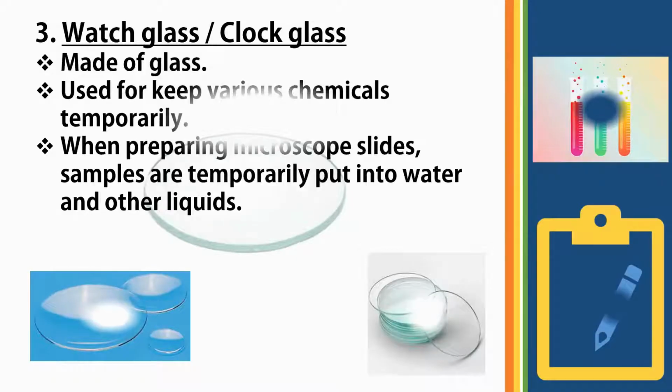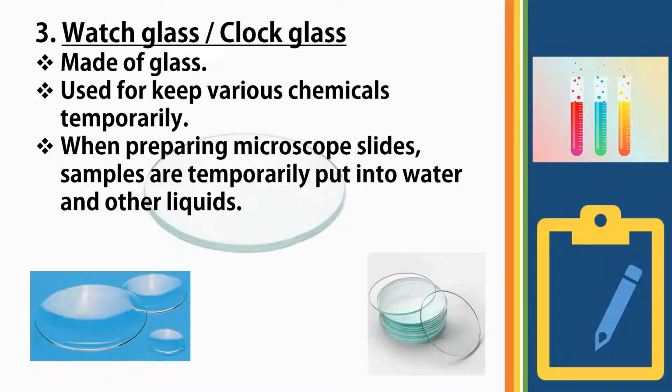Watch glass, clock glass. Made of glass. Used to keep various chemicals temporarily. When preparing microscope slides, samples are temporarily put into water and other liquids.